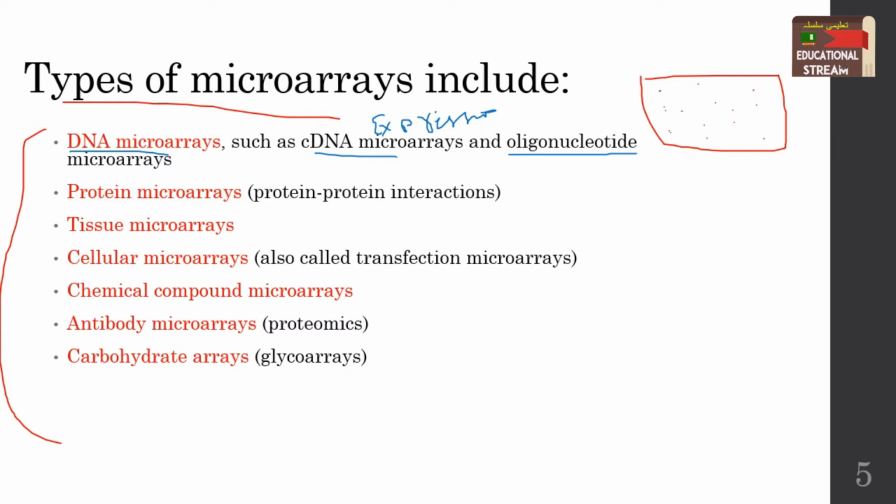The sample that we are going to use has the genes from both the normal as well as the diseased tissue. Spots with more intensity are obtained for diseased tissue genes if the gene is showing an overexpression pattern in comparison to the normal genes, which are responsible for the disease. So we can use the DNA microarray for expression analysis, as well as for mutation analysis.